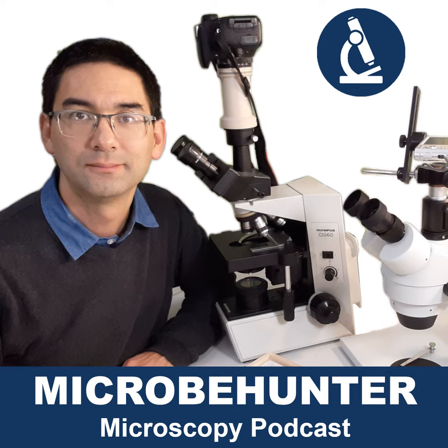So how do infinity optics work? Well, first of all, some things have to be common. You still need an image inside the microscope's tube to be magnified by the eyepiece. That is the bottom line. But the way that this intermediate image is generated is somewhat different in infinity objectives.